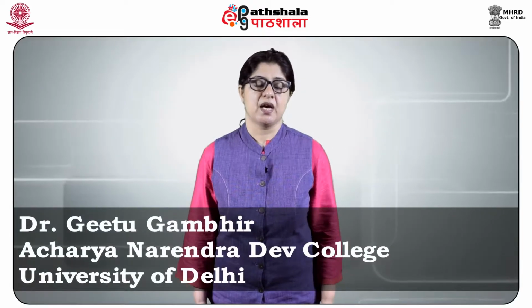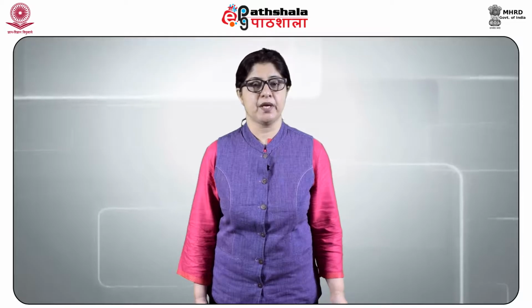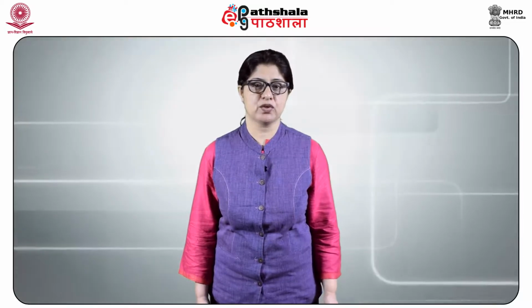Dear students, after studying this module, you shall be able to know about the significance of atomic emission spectroscopy, instrumentation and application of the atomic emission spectroscopy.